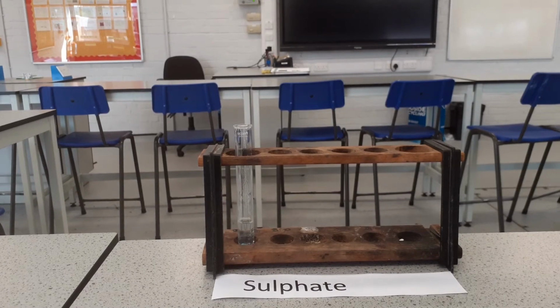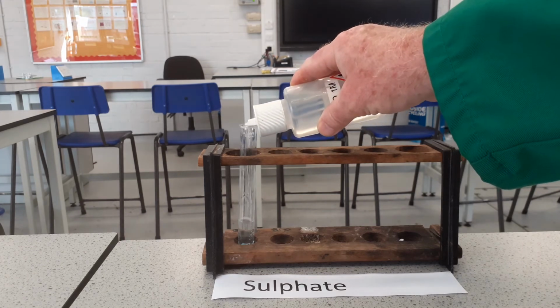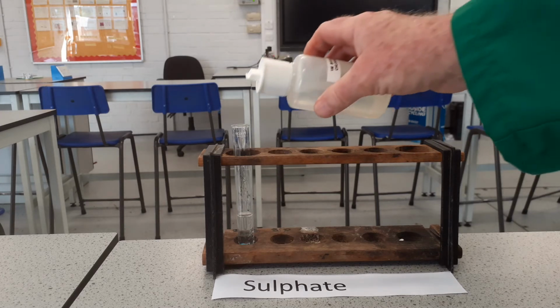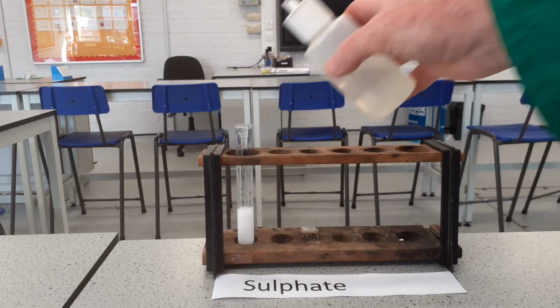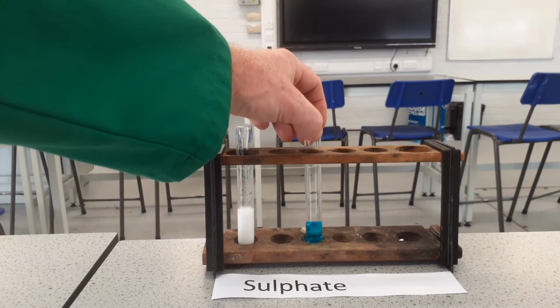In testing for a sulfate, we make a solution, and this will test for soluble sulfates. What we need to add to it then, first of all, is a little hydrochloric acid, and then we add to that barium chloride solution. Now, barium chloride, if you add to it, you can see that you get this white precipitate. This white precipitate is barium sulfate, and every sulfate will do this.